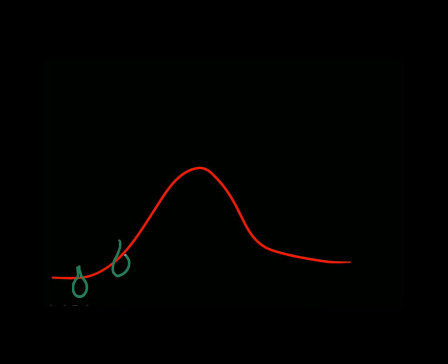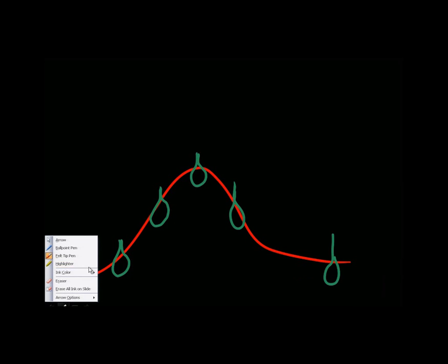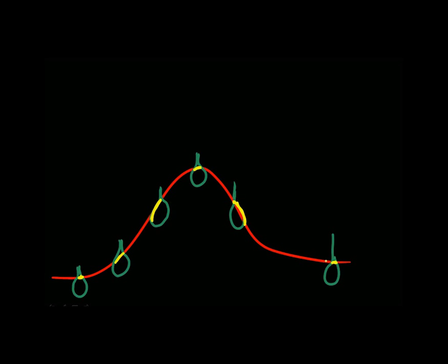And let's look at it here and here. Now, those represent different areas where the electron beam is struck. Now, if you look at the size of that volume which is contacting the surface, you look here, pretty big, a little smaller, very small, very small, very large, very small.